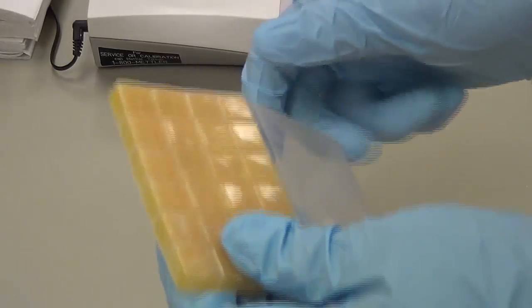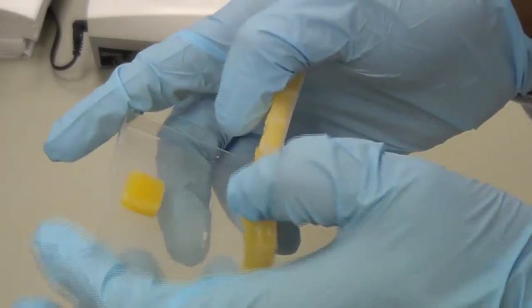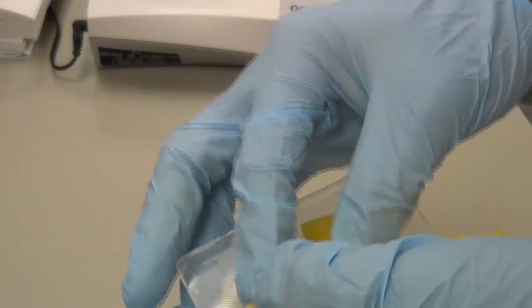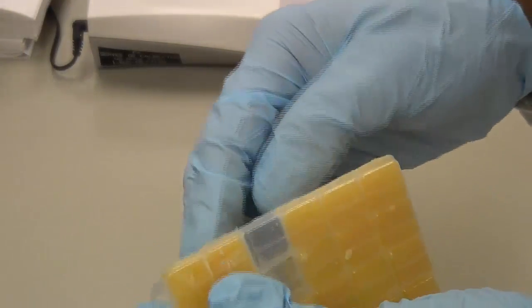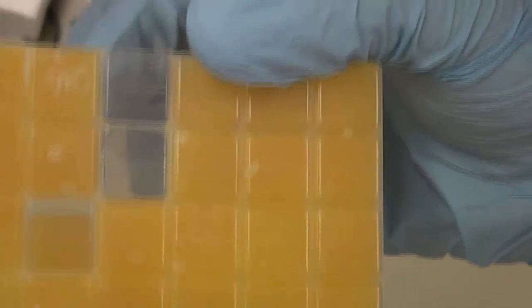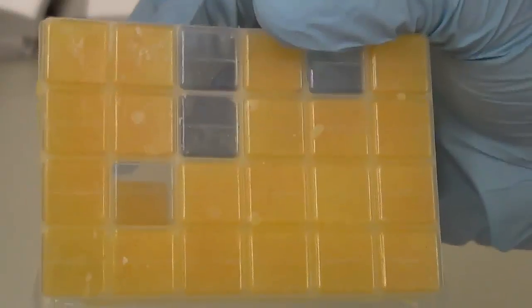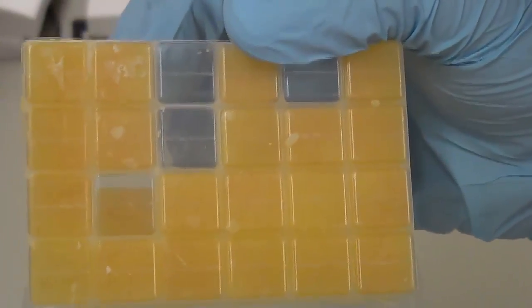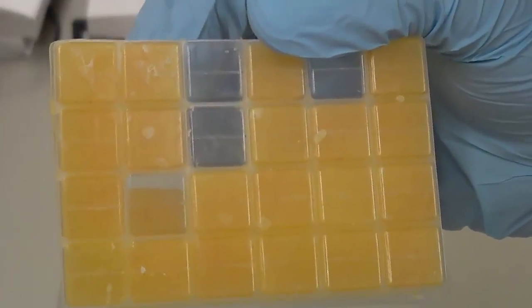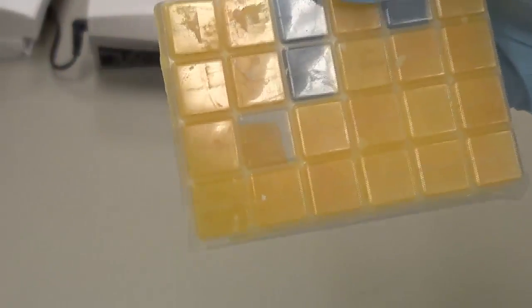Once it gets solidified, just flip it back and bend it gently, and you can see the troches. Before you take off all the troches, turn it back and notice visually whether the drug is uniformly distributed or not. If the drug is not uniformly distributed, that means you made some mistake while pouring. If it is too hot, that means you poured it too early. You have to carefully address all these issues in your next preparation.